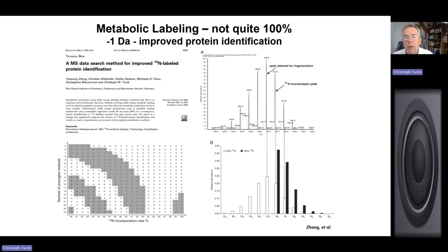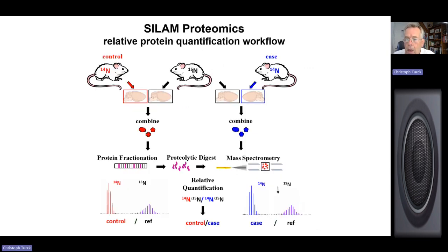So I'm telling you all this because, when you do SILAM, as you go along, like in science always is the case, you sometimes have to develop certain tools to optimize the method. But this worked out really well for protein identification. Now, this is also an important aspect to consider.